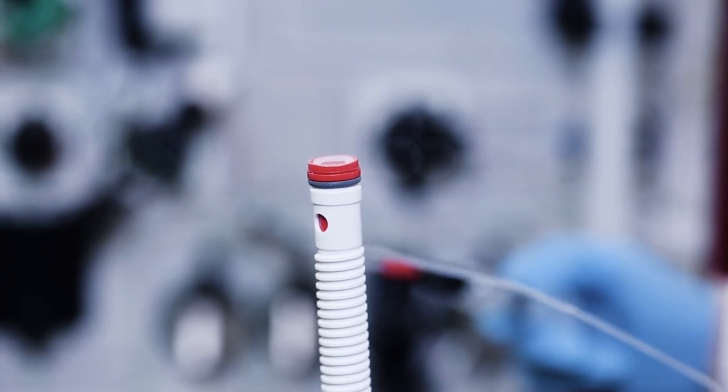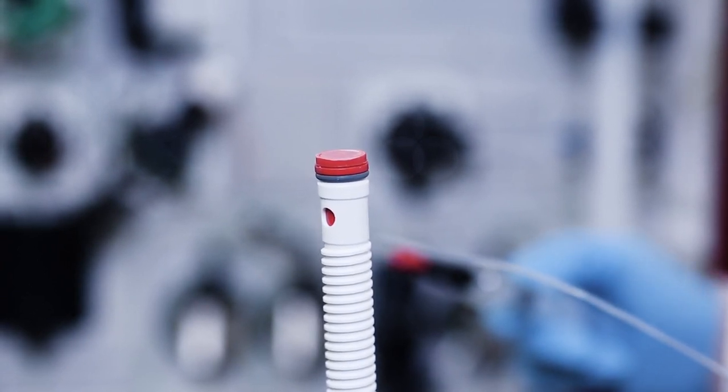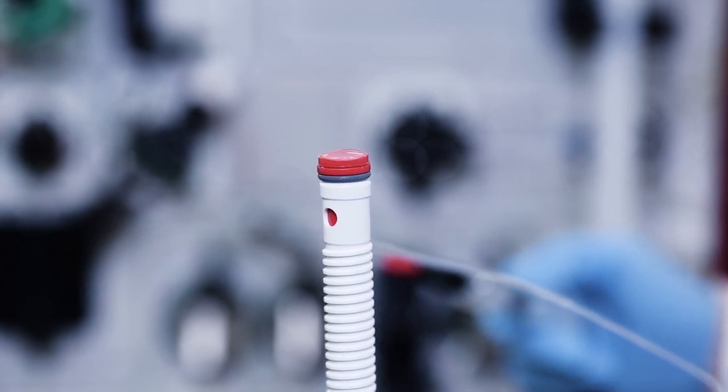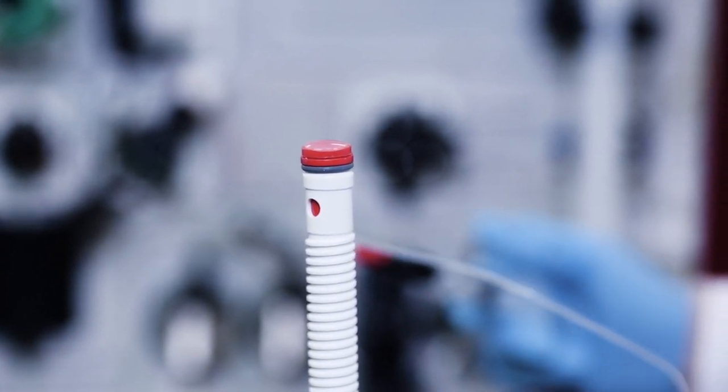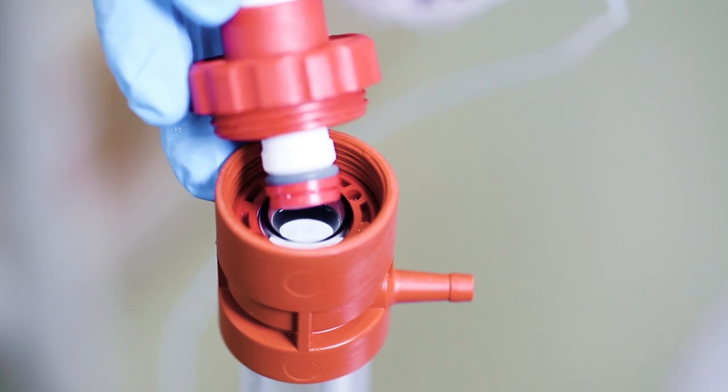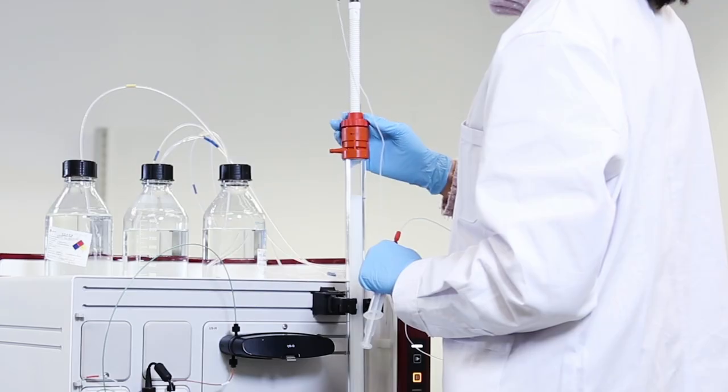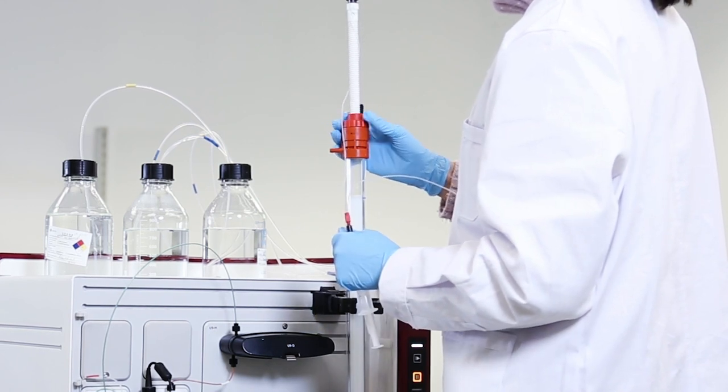Remove air in the adapter by injecting 20% ethanol. Let the ethanol stay on the net. Take the top adapter and fit it to the top of the column at 45 degree angle. Avoid introducing air bubbles.